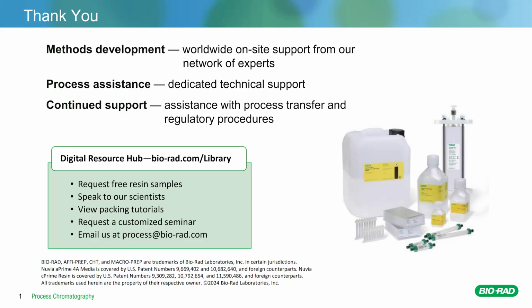And adding to that, in downstream processing, when you think about how purification workflows usually involve multiple column steps, you can see how levels of endotoxin at each step, even if they're very, very low, can build up. Hence the importance of stringent cleaning procedures and regular testing at various stages of a purification process. And why it's also good to incorporate endotoxin depleting resins, such as the ones described here, into purification processes.